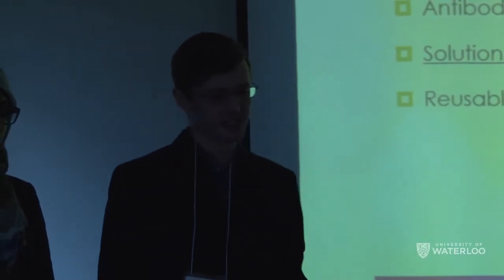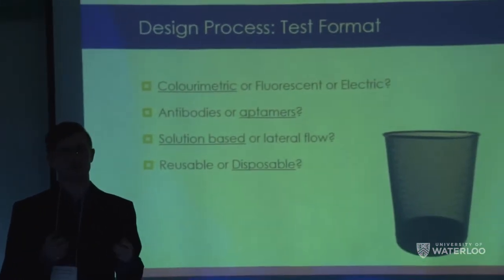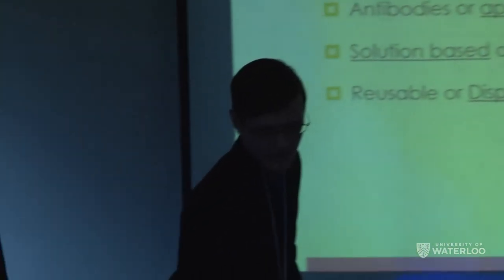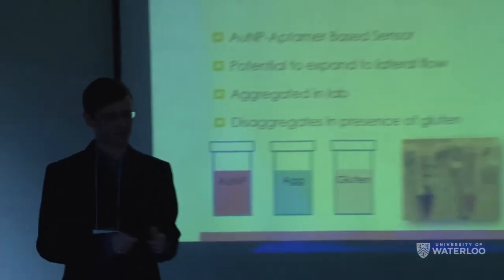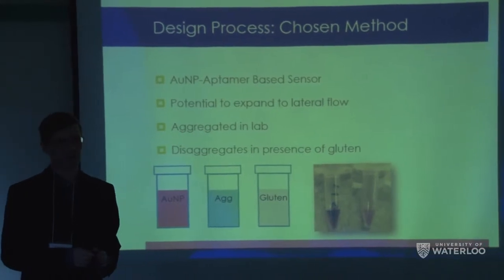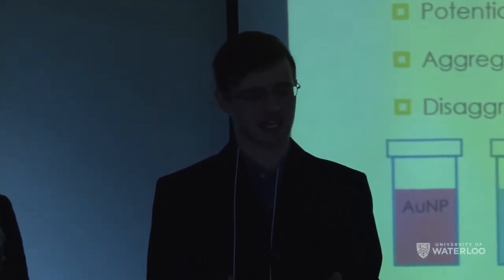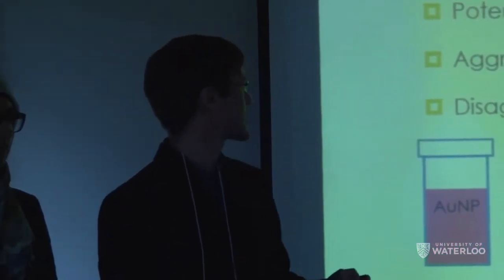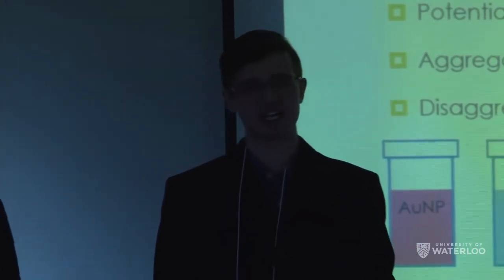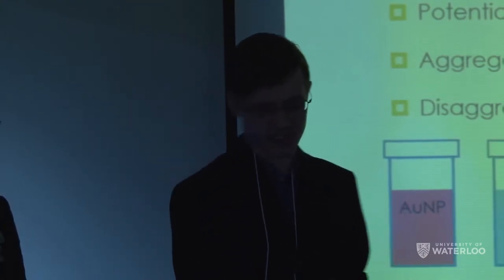And the last question is, should our test be reusable or disposable? We went with disposable so that we don't have to worry about proper cleaning procedures and how things degrade over their lifetime. So to give a quick overview of our chosen method, we're using a gold nanoparticle aptamer-based sensor. Gold nanoparticles are commonly used to add a colorimetric component to other tests. Just a quick note, AuNP is a common shorthand for gold nanoparticles. Our method is currently in solution, but we have the potential to expand it to lateral flow. We prepare aggregates in lab, and then they disaggregate in the presence of gluten.